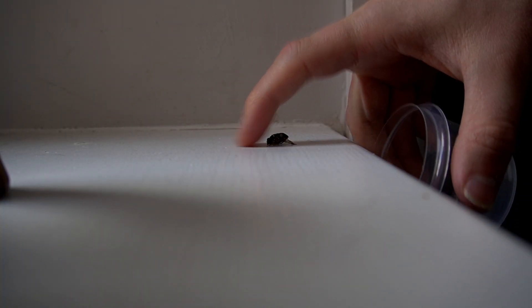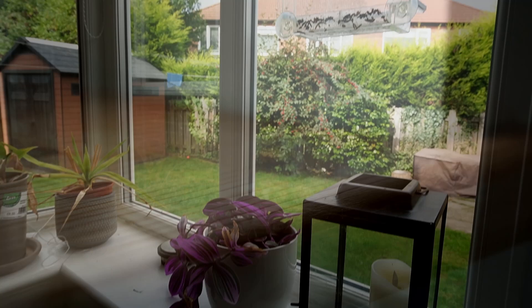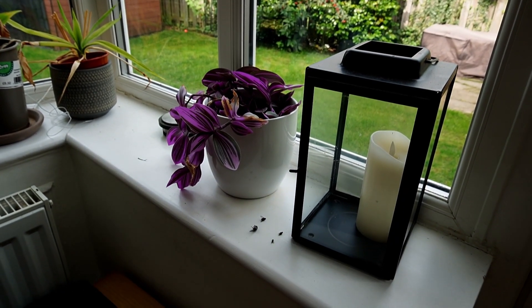With a new experiment bubbling in my brain, I went around the house to see if I could find a collection of flies to inoculate, and it wasn't very difficult because I hate spiders and I hate hoovering.